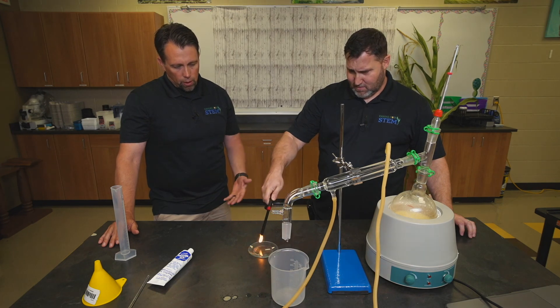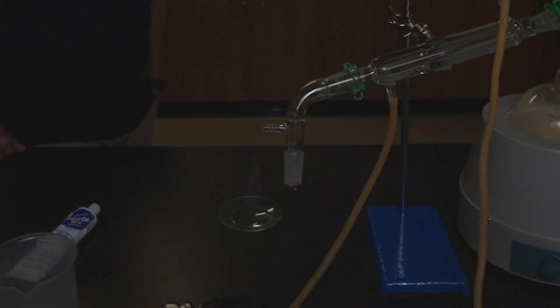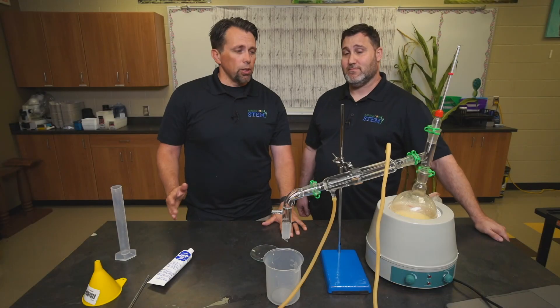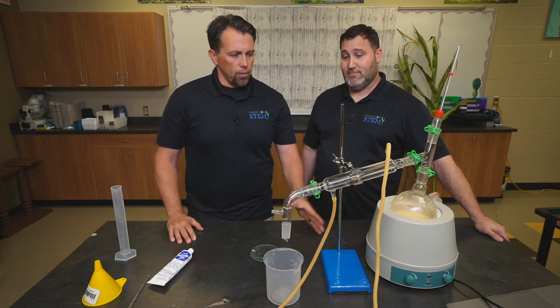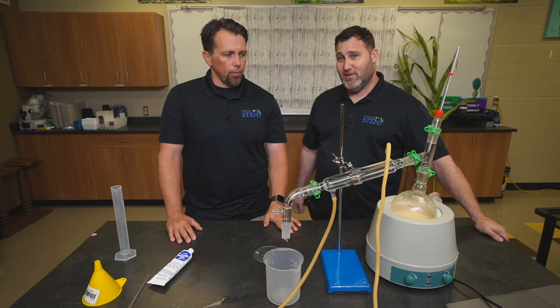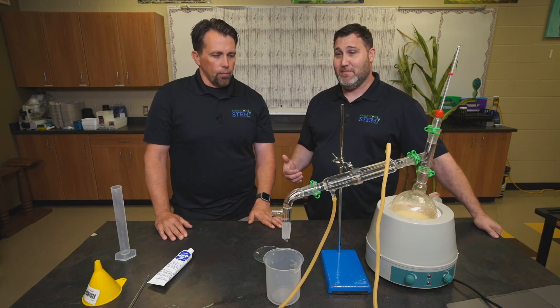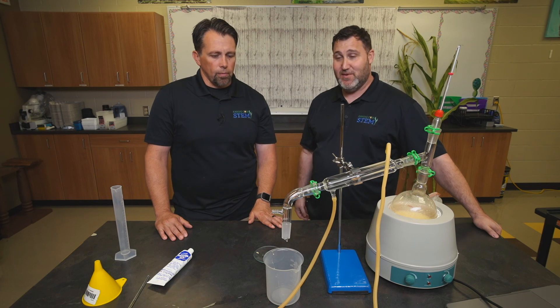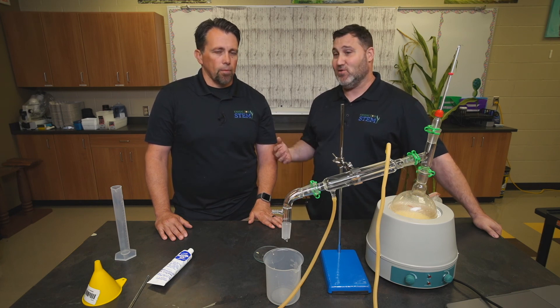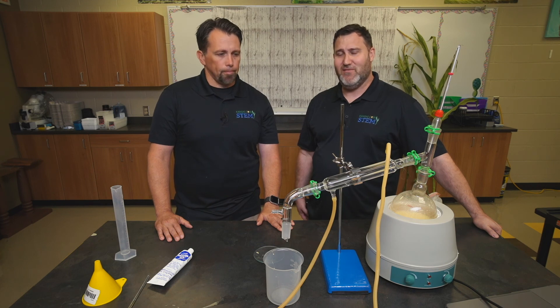We're going to pour some of our distillate into a watch glass, and if it will sustain a flame it's in the 35 to 40% ethanol range at least. Sometimes you have to heat it a little bit to get it to start evaporating. And it's lit — it's burning, with a good sustained flame probably about 5 to 6 inches tall. If you attend a Seed to Stem workshop, the glassware, the mantle, and ring stands are provided by Renew Kansas and Kansas Corn. We'd love to see you making ethanol in your classroom with your students. If you ever run into any issues, you're welcome to contact myself or James through Kansas Corn STEM, and we'll be available for any questions you might have.